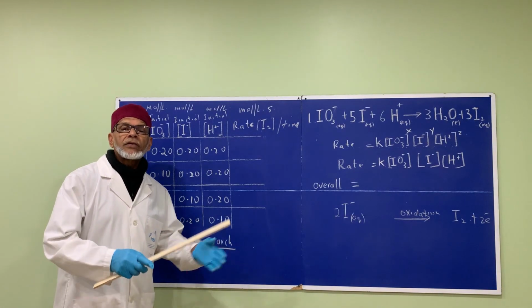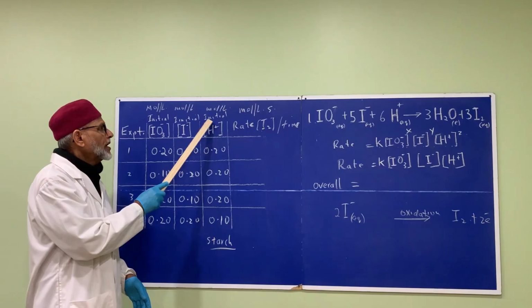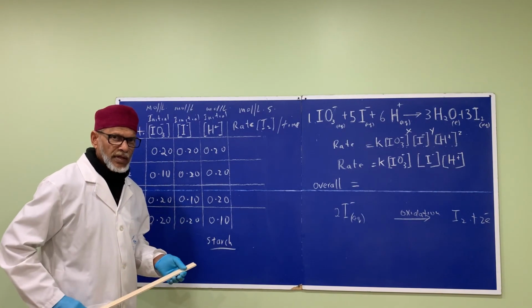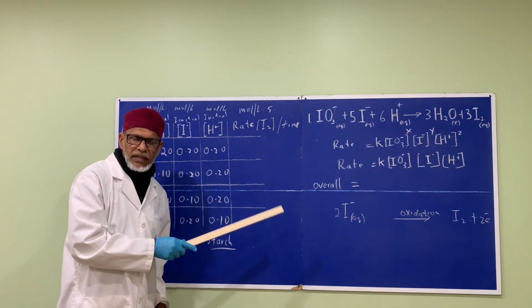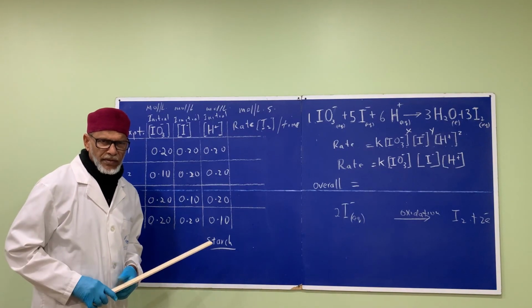In the other video that I've done, I stressed the importance of initial concentration. Watch that video again, and you'll see why we're using that word. And we're also looking at the time for the initial production of iodine. So that is what we're going to do now. We're going to carry out these experiments.